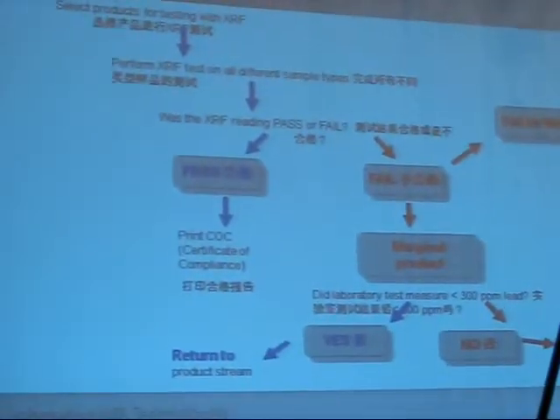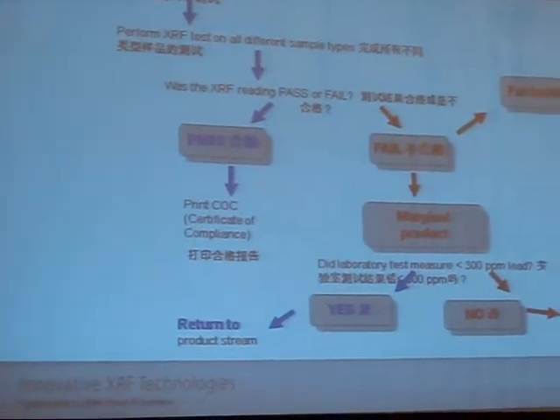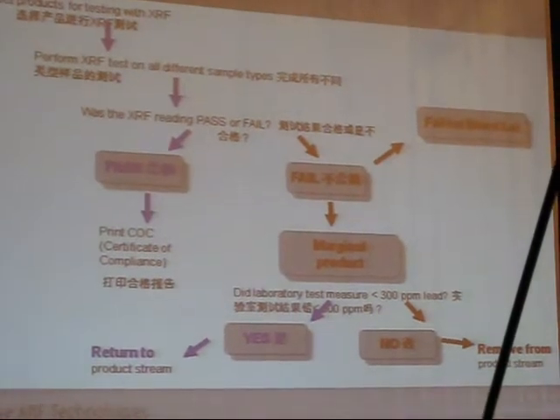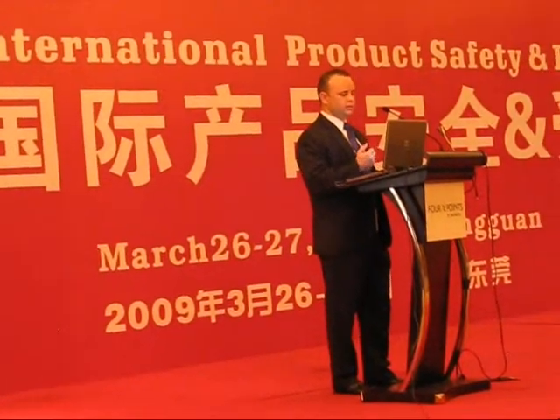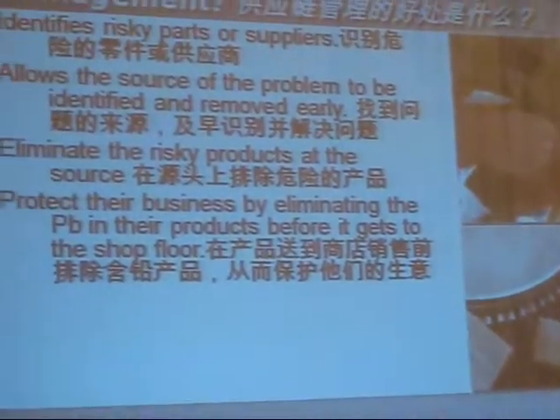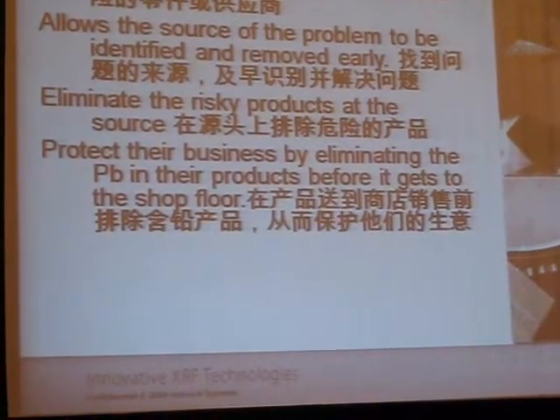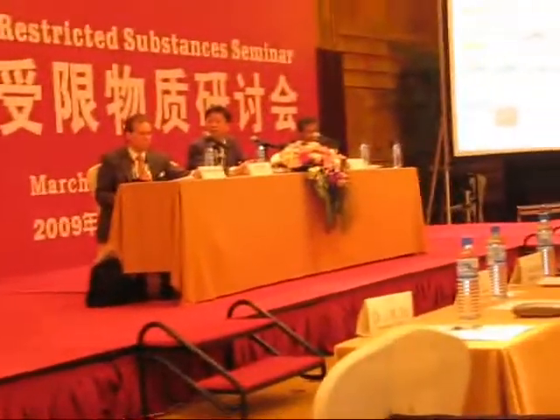What we're showing on this slide is an example of a screening methodology that we have seen companies implement with the portable XRF. In this case, the products come in and are analyzed in an incoming QA. The portable XRF goes through and they develop a sampling rate of the material coming in. If it passes, if there's no lead content, then the toy is cleared. If there is lead, it will pick up the lead. If there's a lot of lead, it will tell you there's a high level of ppm, and you'll know there's an issue. Based on that information, you can determine what to do next, which would probably be to dismantle the toy and send it to a third-party laboratory for more precise results.